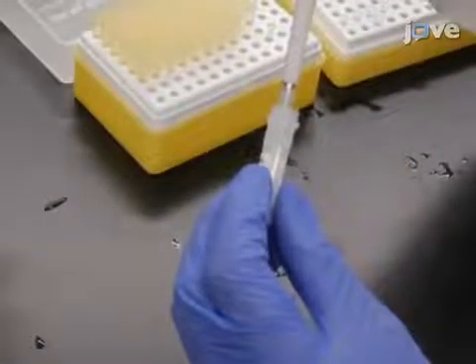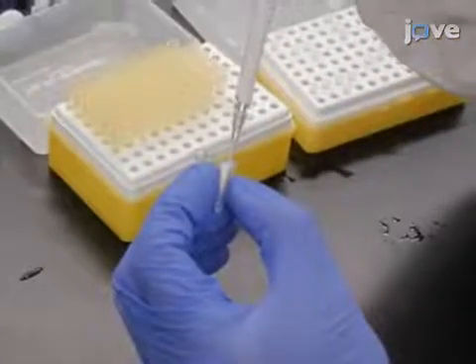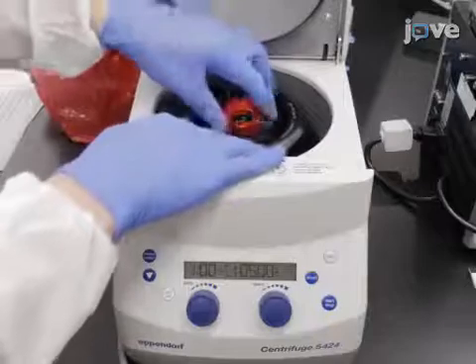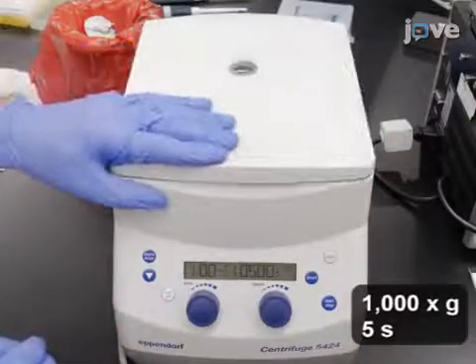Next, add 2.5 microliters of fragmentation mix from the kit and mix the tube gently using inversions. Then, use a pulse of centrifugation to spin down the tube's contents.